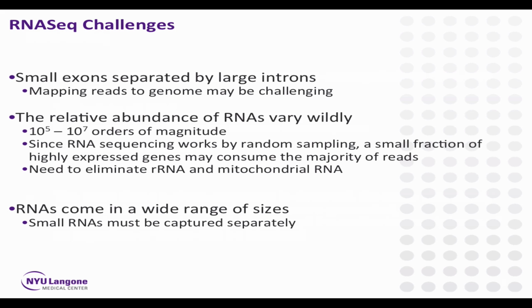So one of them is that until we are actually sequencing the RNA, we are basically sequencing cDNA, and there could be some cDNA artifacts. So basically, you're going to be mapping back all those sequences to the genome and to the transcriptome, but mapping reads to the genome is more difficult because in the genome, your reads that are going to be only in the exons are going to be separated by the introns. So that creates an additional challenge.